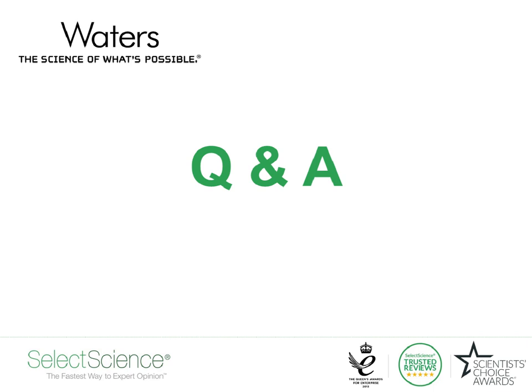All right. Next question for John. Did you try IMS with actinobacterial or fungal cultures? If yes, is the resolution good? Yes, we have done both, and we don't see any limitations in the resolving power.